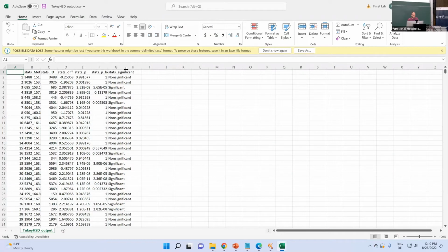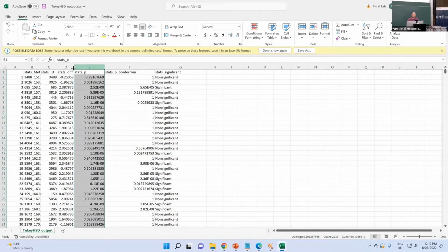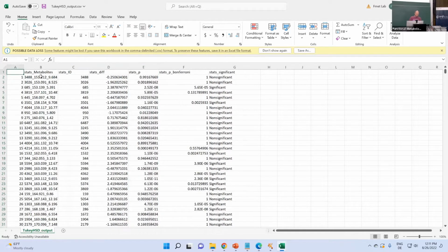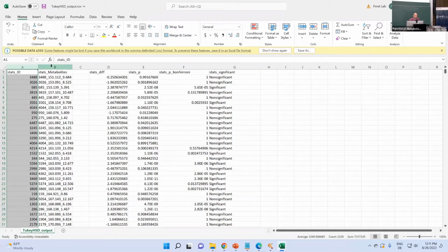And now I just open this in Excel to check out what it is, and very nice, here this would be again my feature ID. Oh no, wait. This one here it is. This would be just an index, so actually I don't need that. I'm just going to delete that and move that stats ID to the front.